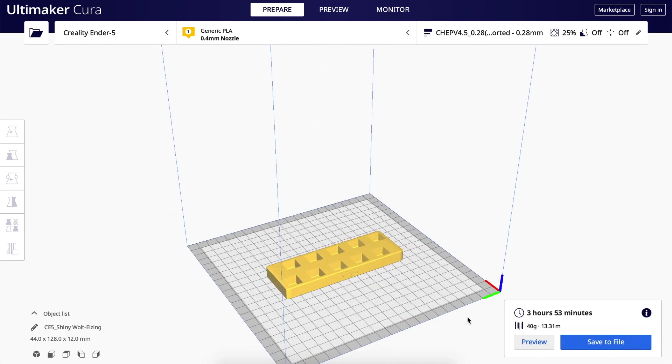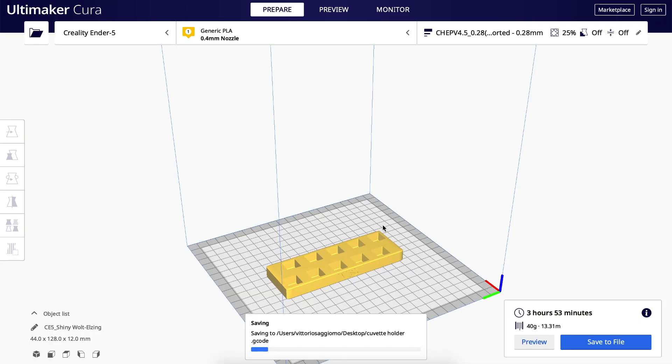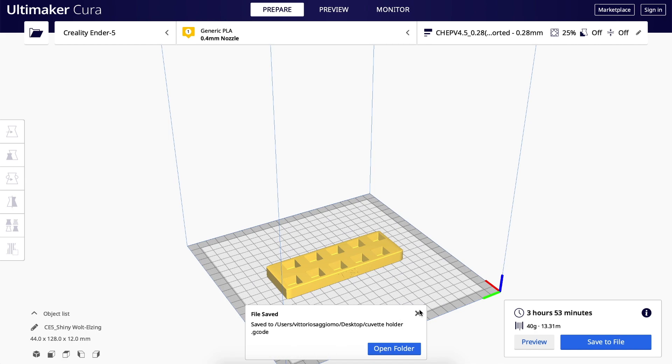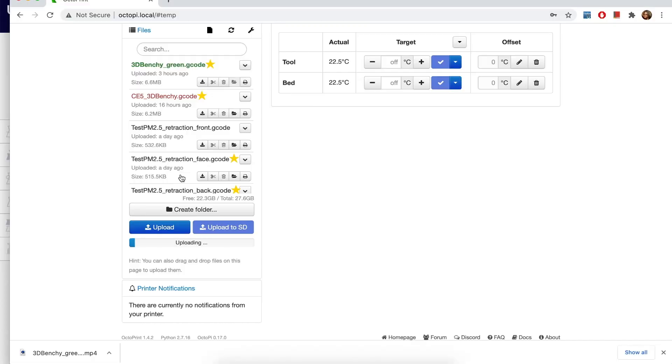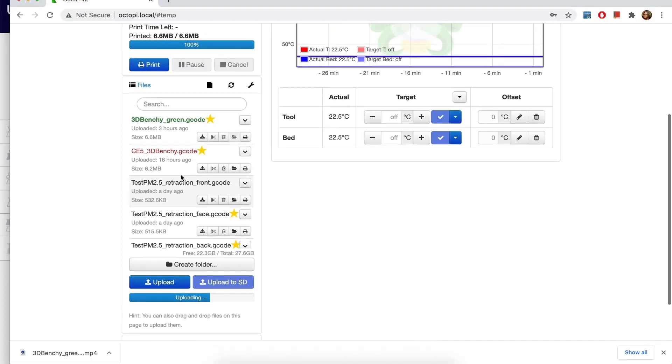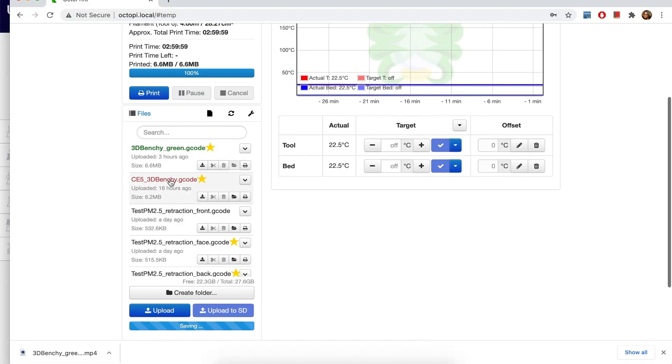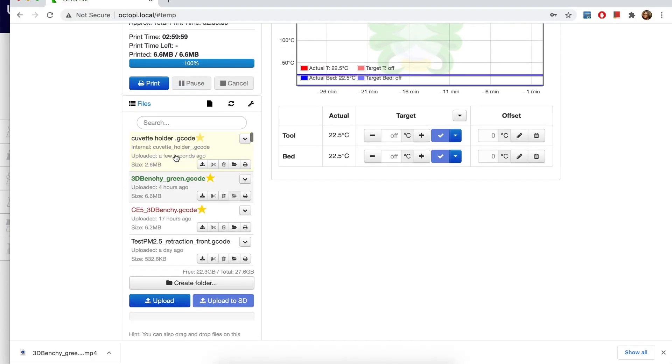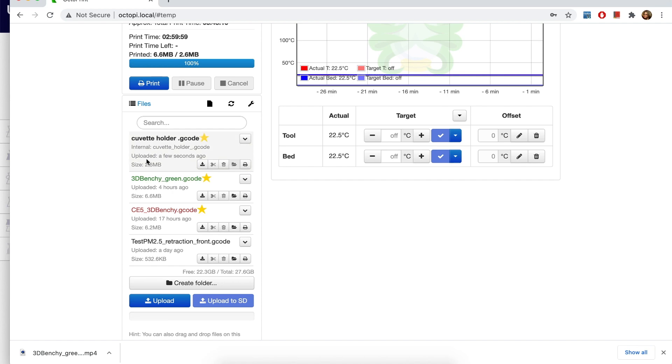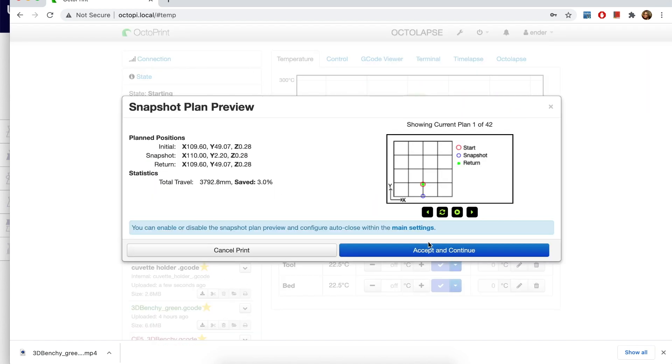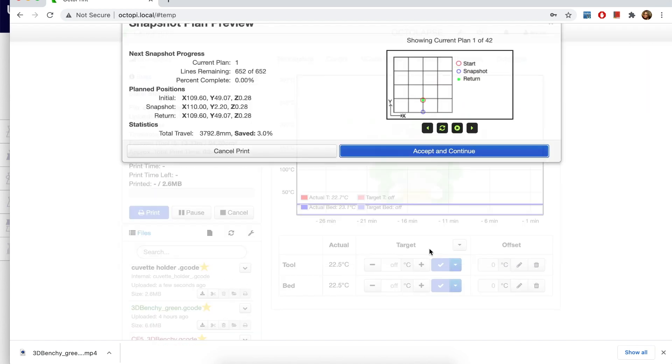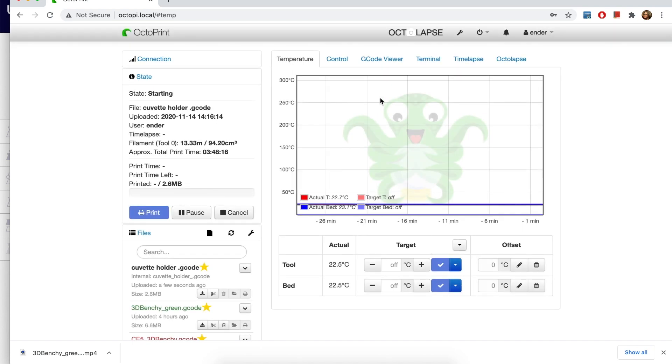Then I slice it. Four hours, 40 grams of material. I save it. And then I'm just sending it to the printer. So now it's uploading. Uploaded. And let's print it. Okay, see you in four hours.